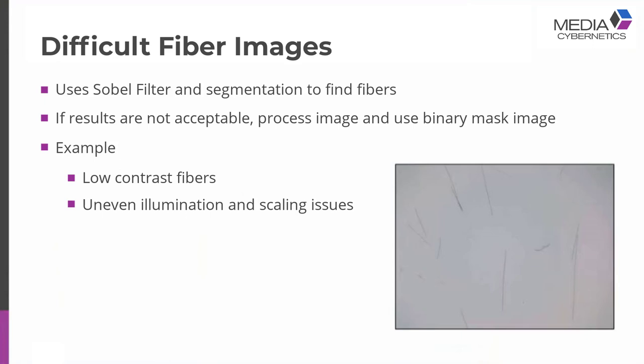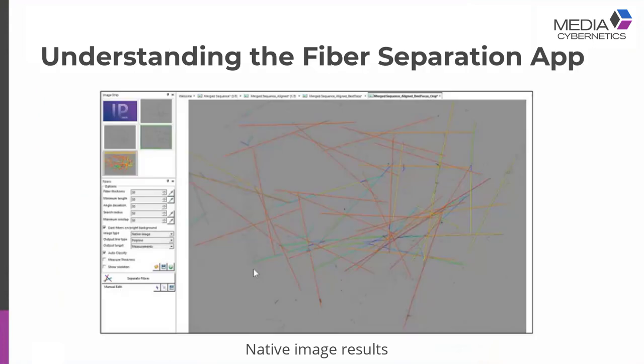If you get into a situation where you can clearly tell it's not picking up the fiber, you can use a little bit of image processing — whether it's a flatten filter, count size, or some other filter — to help bring the fiber up from the background and use that as an input. Running the app with default settings, it's not too badly picking up a lot of these carbon fibers, but it's totally missing some areas. Looking at the image more closely, there's some uneven illumination — fibers are blending into the background with not much difference in gray level.